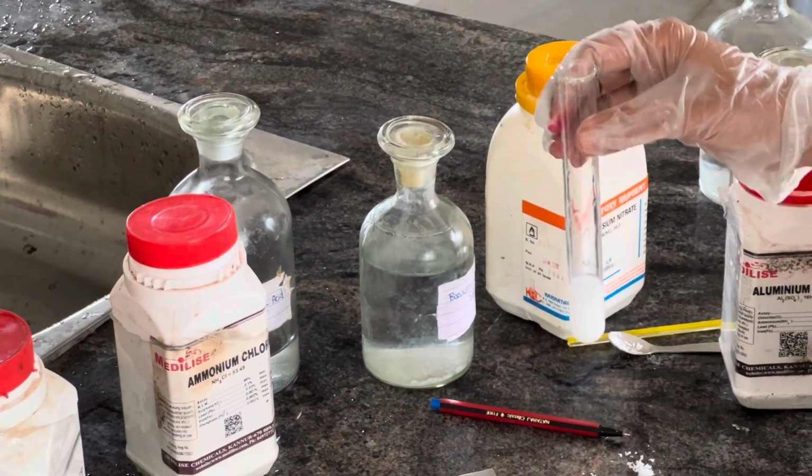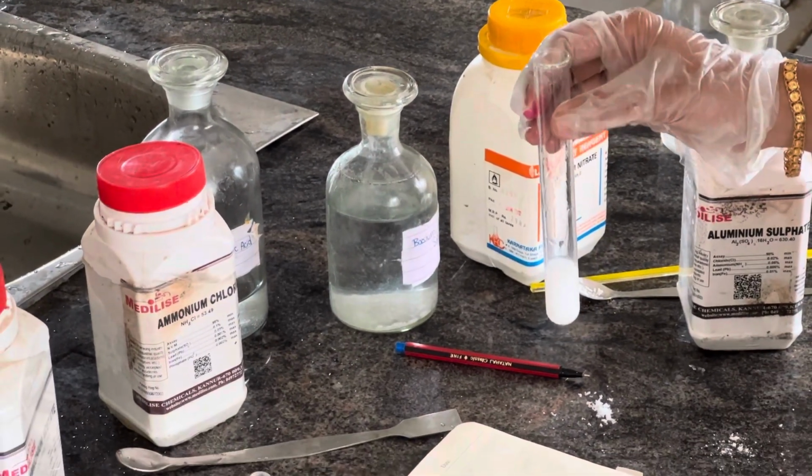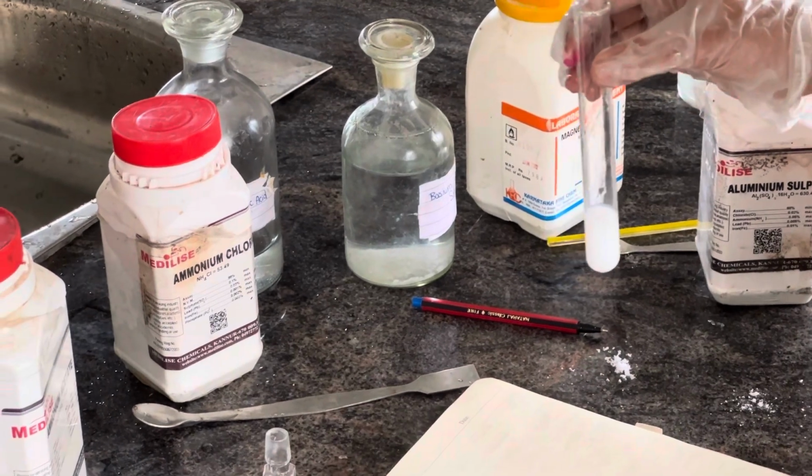So in this experiment we have analyzed the different anions like carbonate, sulphate, nitrate, then acetate, etc.